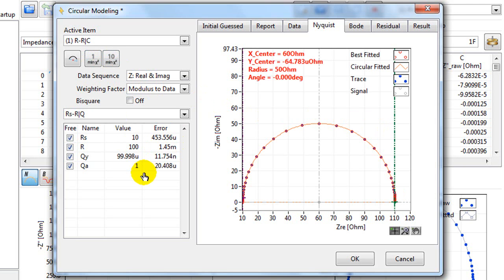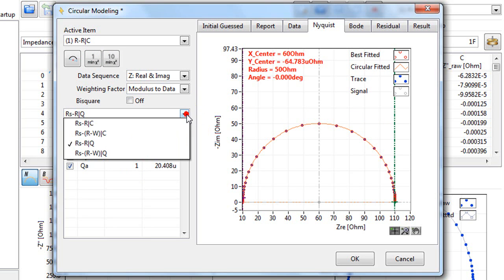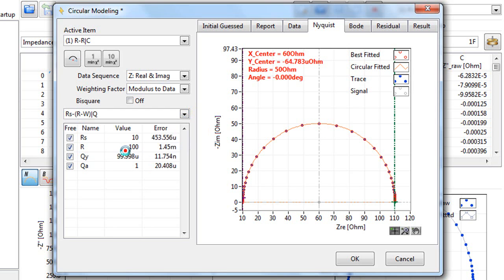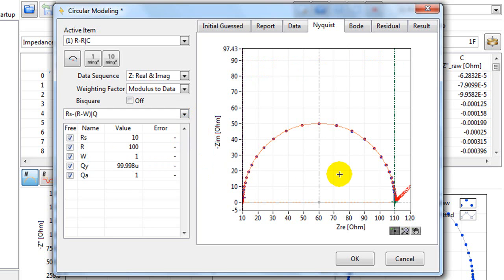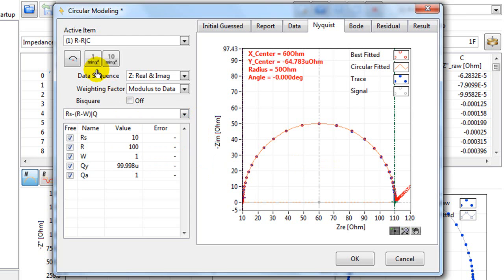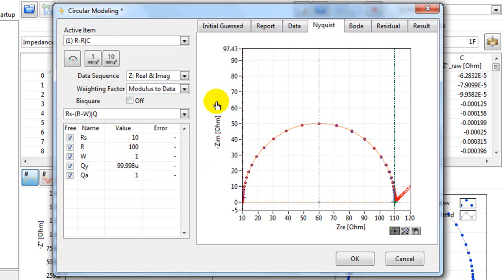If the circular data has Warburg diffusion element in it, you can select it from the drop-down menu. So for example, you choose this one. You move the cursors again. And again, you click either the one time or ten times fitting. I'm not going to do this for this data.